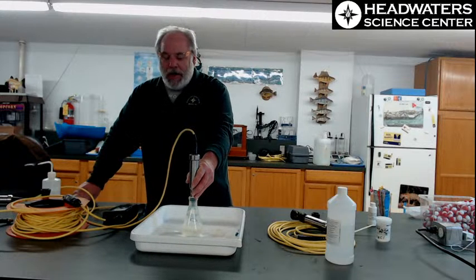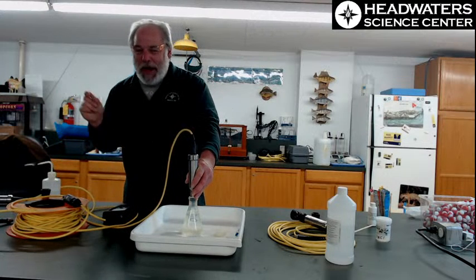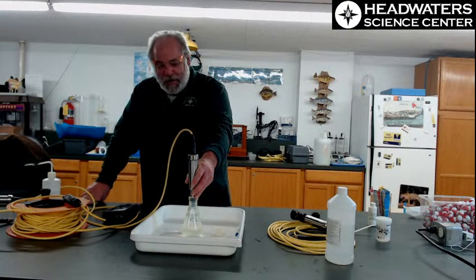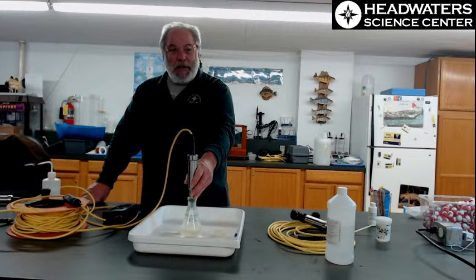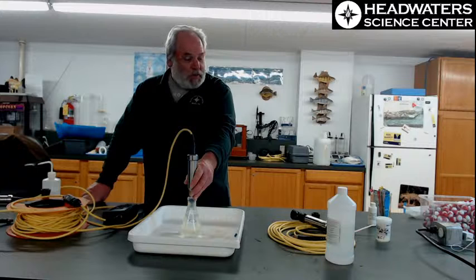I don't know enough about the meter to explain it, but it almost looks like it's looking at red and blue shifting. A red light and a blue light will come by, and that tells me everything is good, everything is great. The air on top of that is 65.5, similar to our others. So apparently the temperature in our air here is 65.5. So we're working with that.